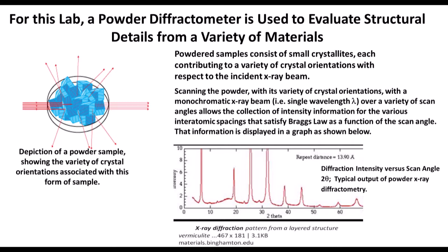orientations. So in a powder X-ray diffraction experiment, you have the greatest chance to avoid what we refer to as texture, meaning that we sample a material for which the orientation of crystals involved are not random. So a powder X-ray diffraction experiment allows us to sample a fully random distribution of orientations of a given crystal, and hence the truest measure of the intensity of the peaks associated with satisfying Bragg's law.